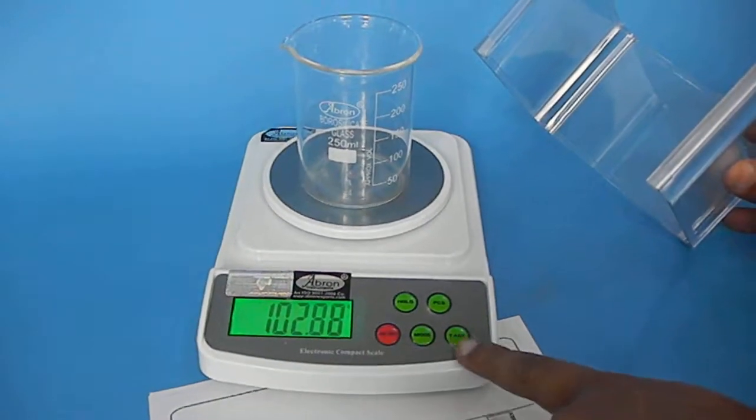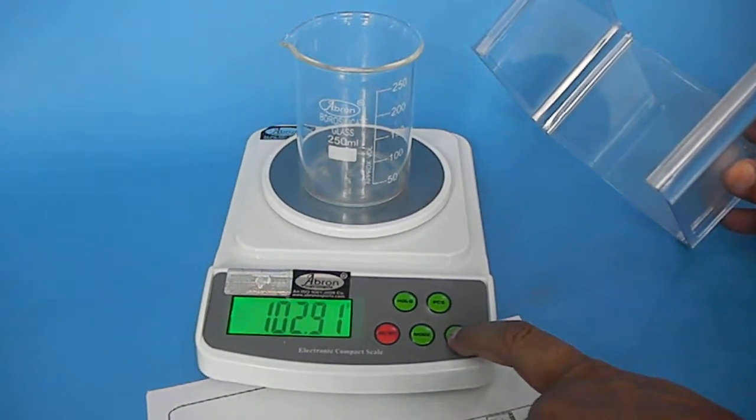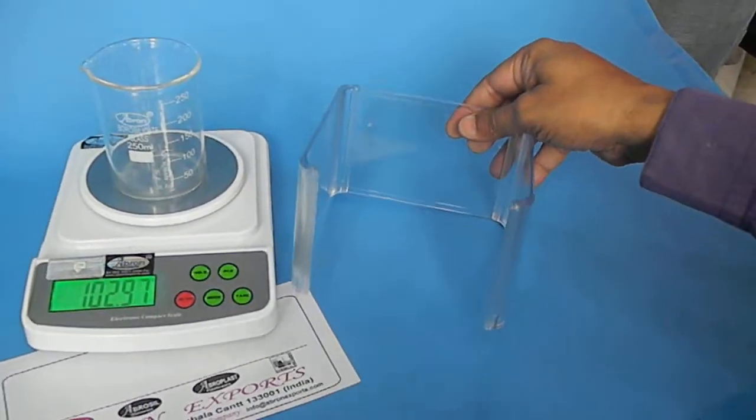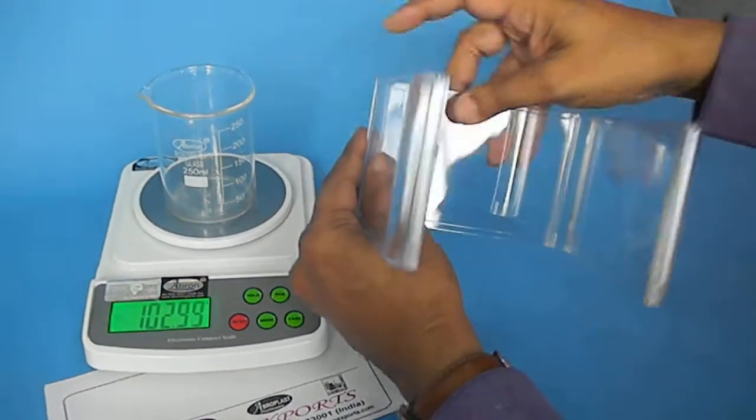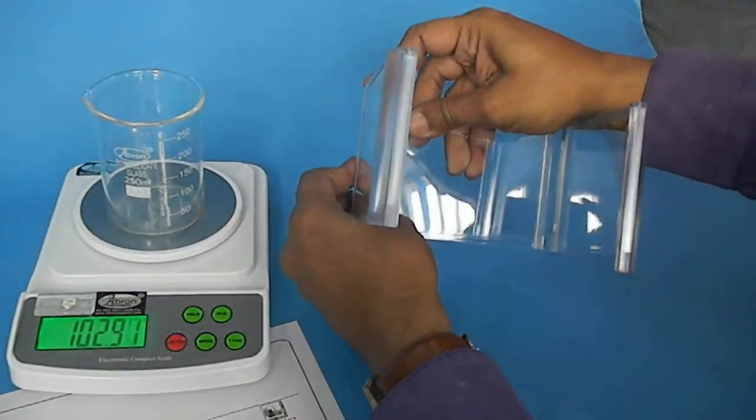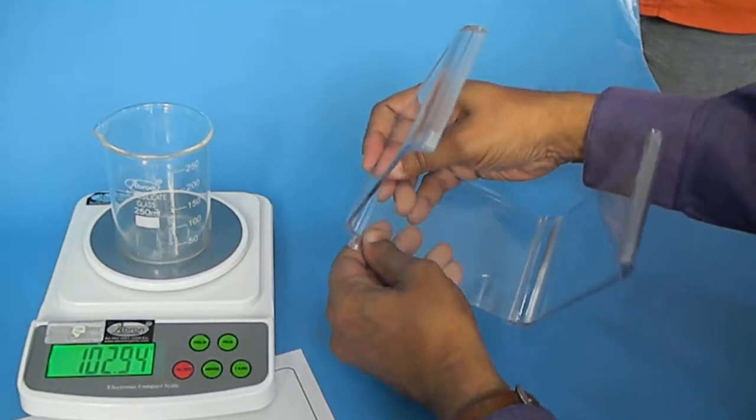This has a tare system, counting hold, and a chamber which you can connect by sliding. It comes out by sliding, and you can also slide from the other side to put it back.